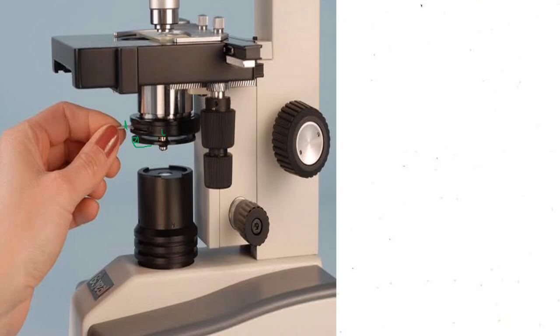This is the condenser. All of this here is the condenser, and this knob here helps to control the amount of light that enters the specimen. Of course, you know that the specimen is somewhere here, and this is the objective lens. Whatever light comes from the illuminator here is directed into the condenser. The condenser gathers the light and directs it to the specimen here. Okay, so that is that. Now let's look at the next part.